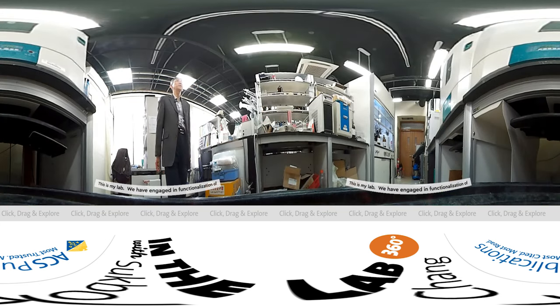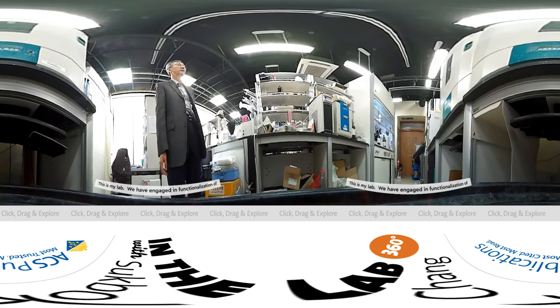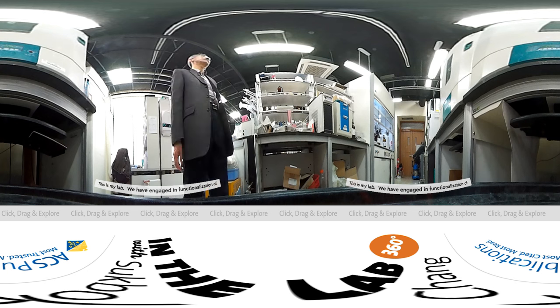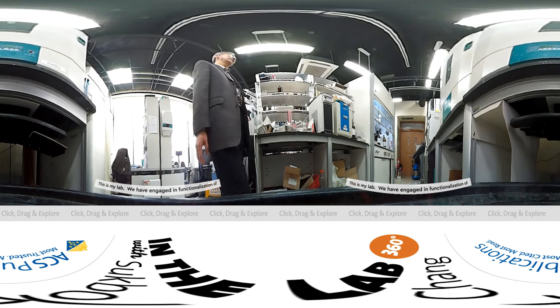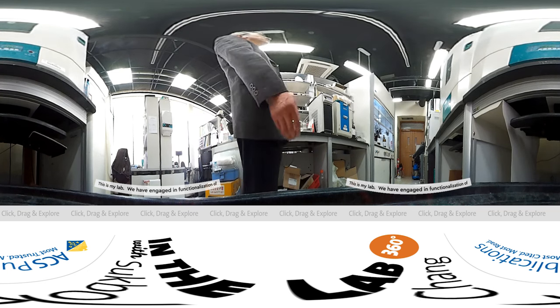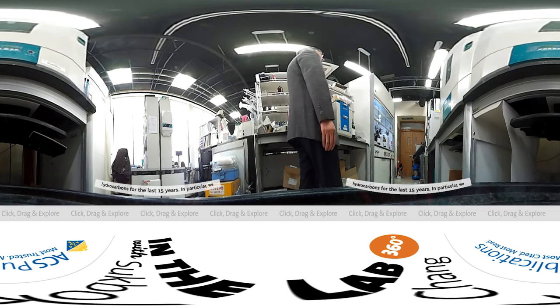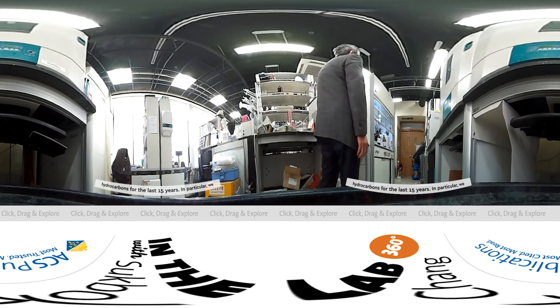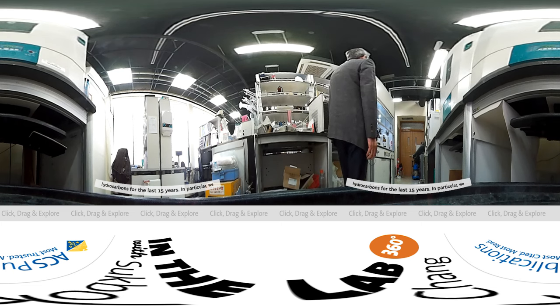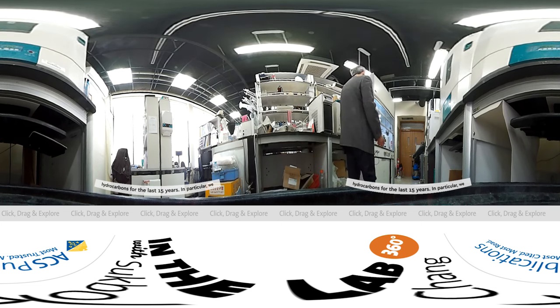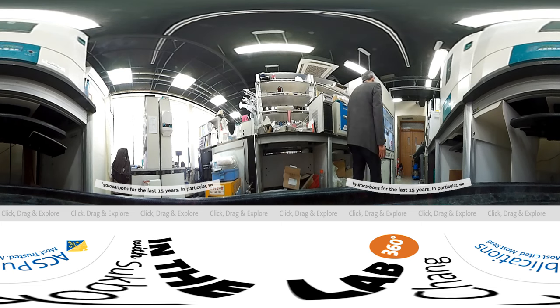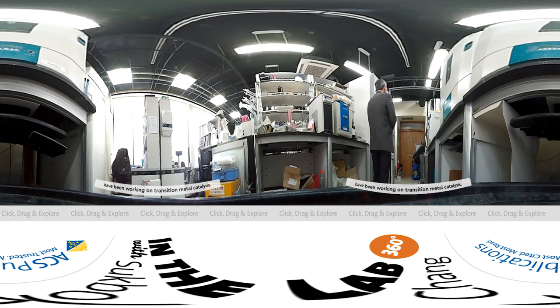This is my lab. We have been engaged in functionalization of hydrocarbons for the last 15 years. In particular, we have been working on transition metal catalysis.